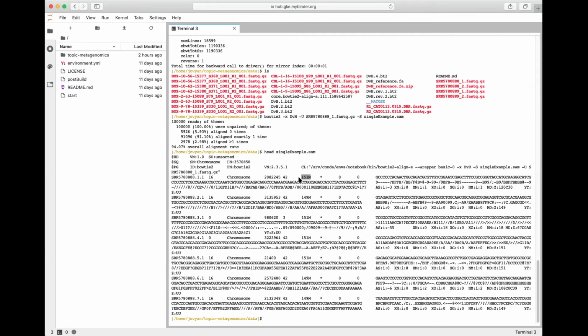Anything else we wanted to show here? This is the leftmost position on the genome that this read maps to. And this is going to be the MapQ score, right? Yes, you're right. Okay, cool. Awesome. Sorry, I keep calling on you, but no, that's great. Yeah, I'm not sure. You can cut all these sections, and that's nice.